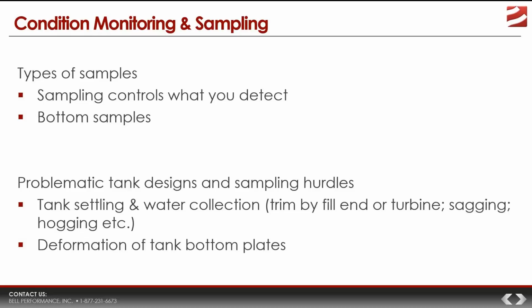And microbes, however, often go undetected for long periods of time because of incorrect sampling, incorrect testing, or a combination of the two, which is even better. You've got bad sampling, you've got bad testing, or we could have both, you know? Of the two, sampling versus testing, incorrect sampling is probably the greater problem. Now, detecting microbial contamination always starts with sampling.